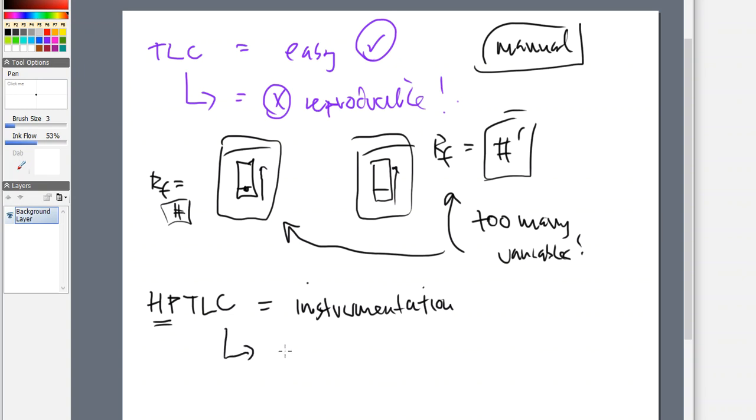What you're seeing now is that organizations like the USPNF, which is all pharmaceutical-driven regulatory material, and if you've taken our CTC 115 course, we went into drastic detail with our USPNF discussions, are actually including HPTLC technology at this point, finally. They are saying, listen, we need you to get on board.